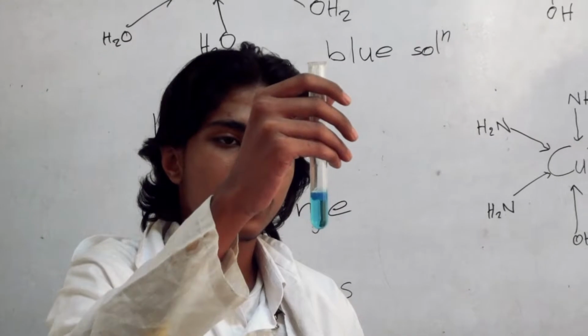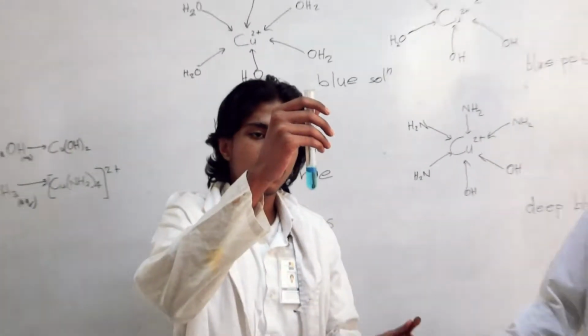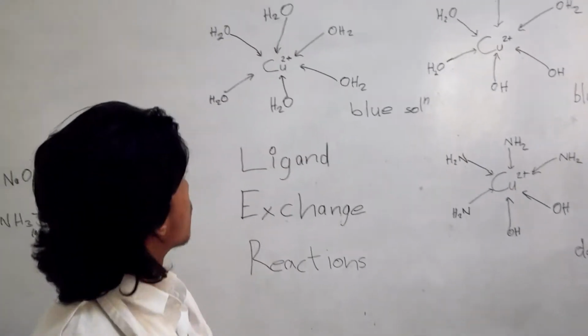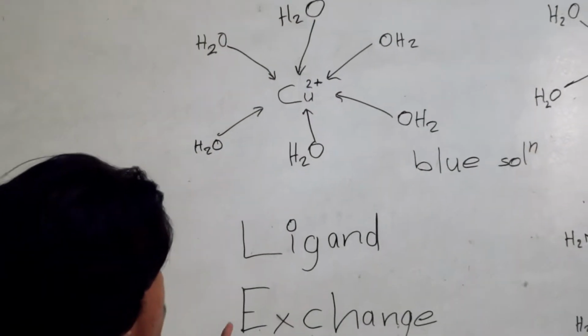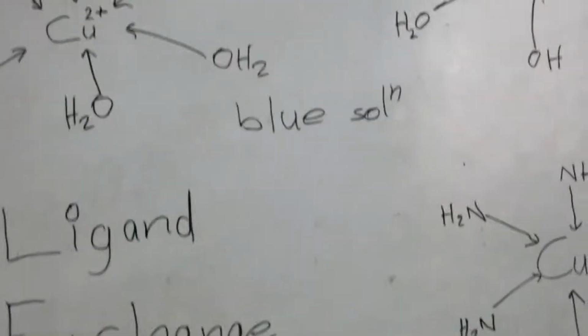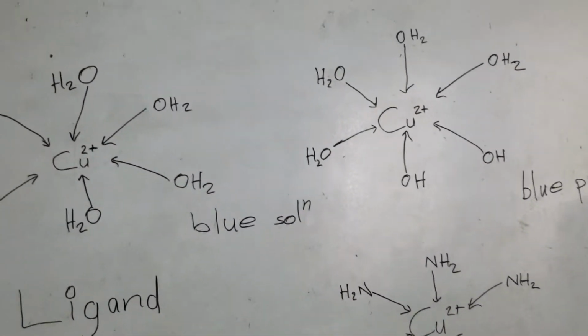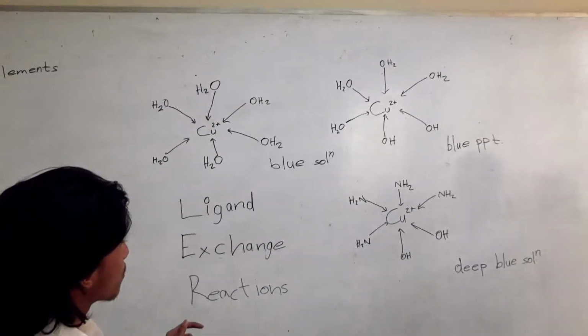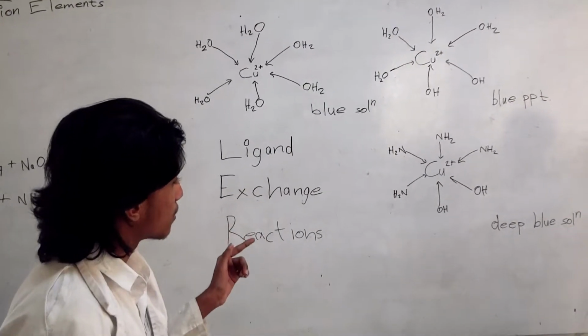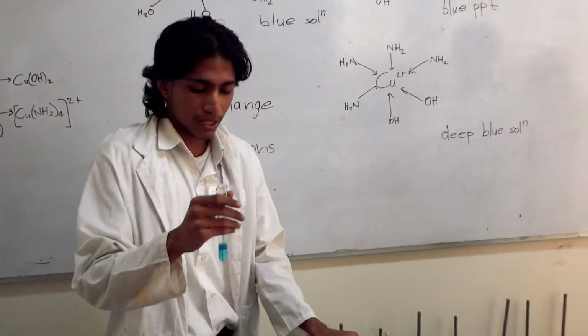As you can see, the precipitate is a pale blue color. Now what's happening here is that the water in the copper II sulfate is being replaced by hydroxide ions from the sodium hydroxide. This is a type of ligand exchange that is occurring, and the hydroxide ion is replacing the water, and the hydroxide ion is the ligand in this reaction. Now adding some excess to this reaction.